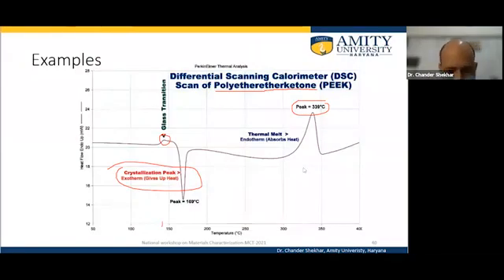Polymers are basically stable only up to a low temperature. One should not go beyond the melting point, because polymers stick to the crucible surface. So generally we stay at a temperature lower than the melting temperature of the polymer. But with proper cleaning, that can also be done.